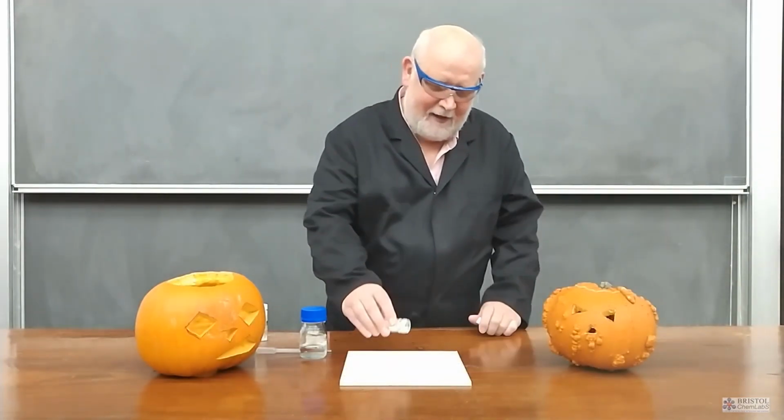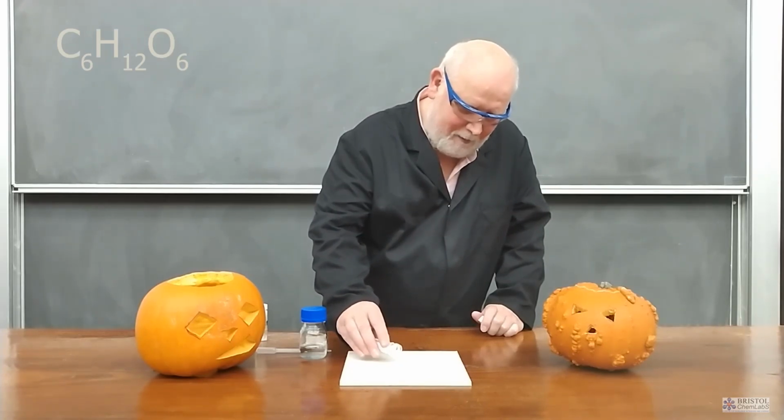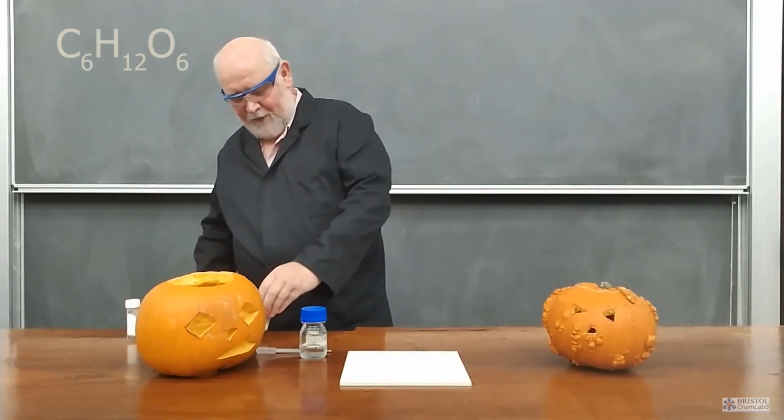Now, as our fuel here, I'm going to use a small mass of glucose, the fuel that fuels human beings and other animals and plants, in fact. Glucose, simple sugar, C6H12O6.